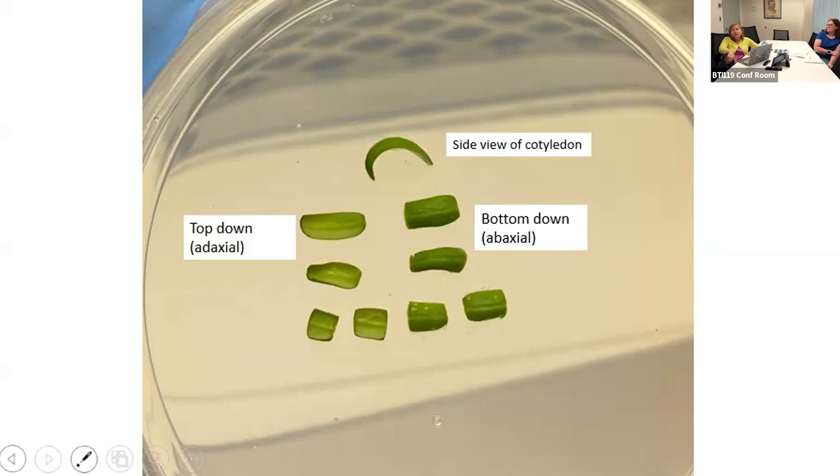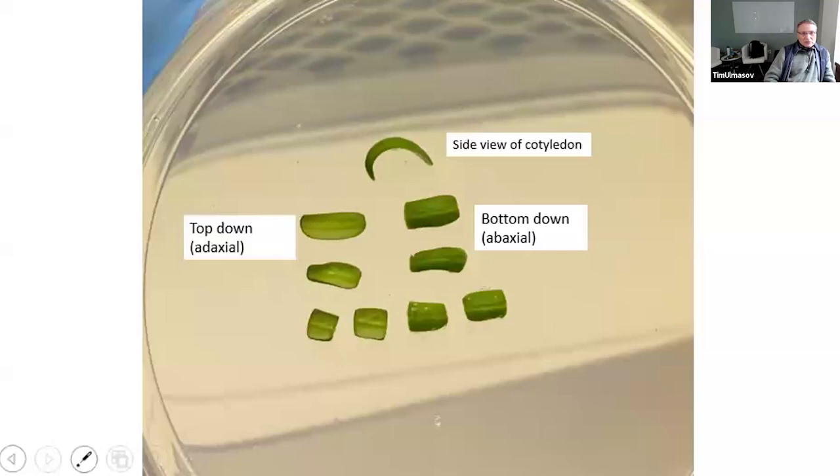We do. We're using the Corteva leaf transformation for maize, and we're using the auxotrophic LBA4404. That works well. We haven't had a problem with overgrowth. I think the selection for that is meropenem. But that's the only experience we have, with that particular one. Okay, so in your opinion, it's worth using auxotrophic strains?